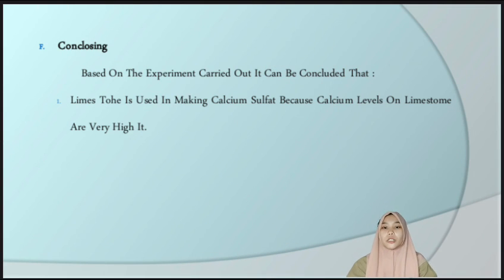The conclusion: based on the experiment carried out, it can be concluded that limestone can be used in making calcium sulfate because the calcium levels in limestone are very high.